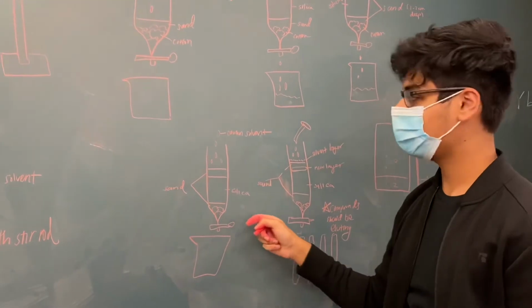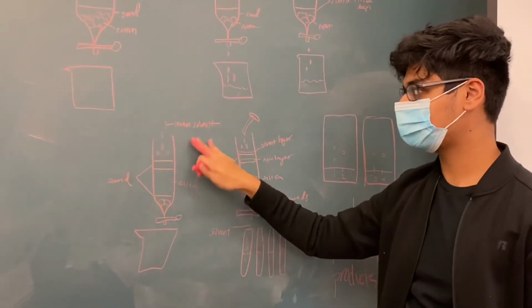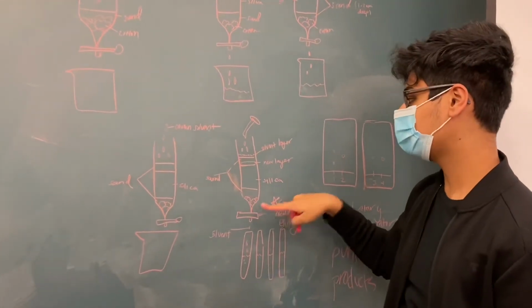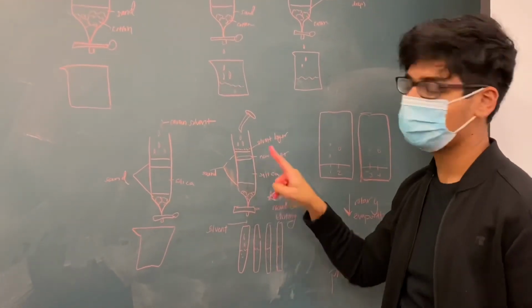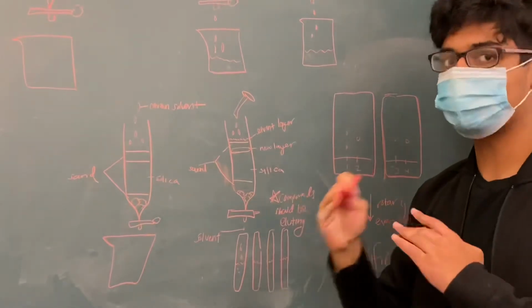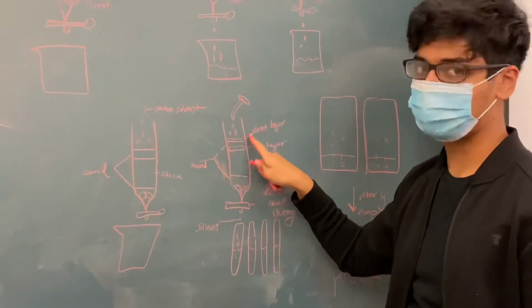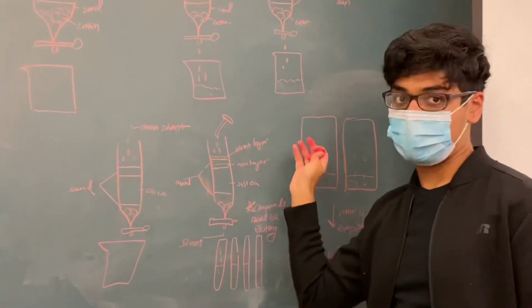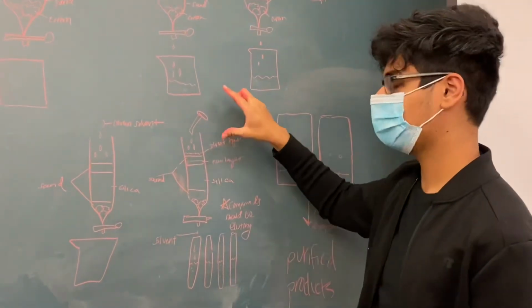Let it go through again, and then after you put a little bit of the column solvent, you should see a new layer forming. So you've got the cotton, then the bottom layer of sand, the silica, and then another new layer formed between the silica and the top layer of sand, then the sand, and then your solvent layer, which you're going to add a bunch more of into that reaction column.